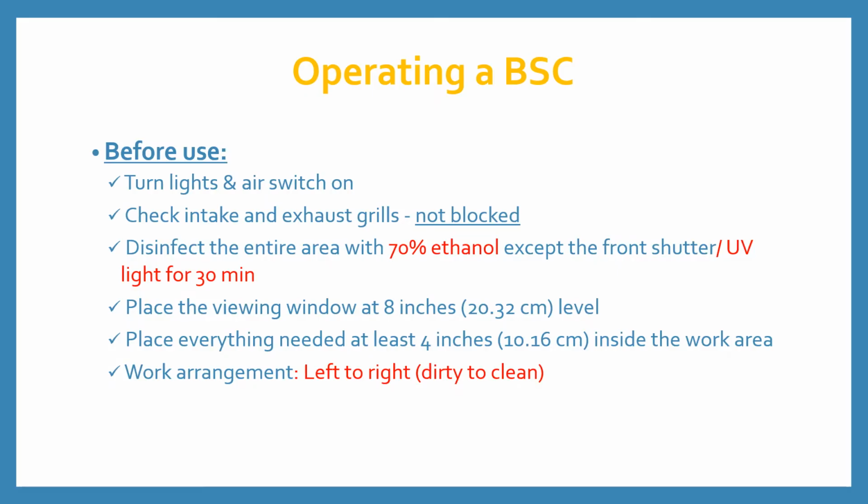Points to remember before operating a biosafety cabinet. Turn on the lights and air switch. Check the intake and exhaust grills for any blockage. Disinfect the entire area with 70% ethanol except the front shutter, or with UV light for 30 minutes.